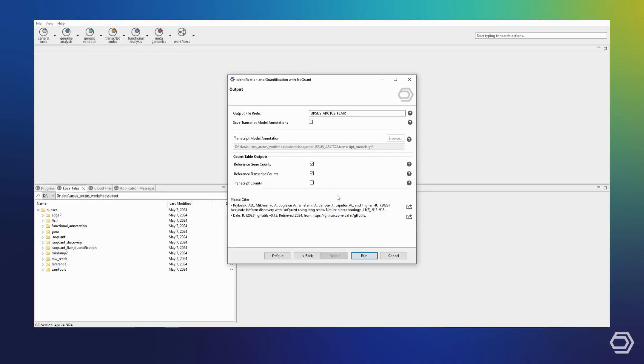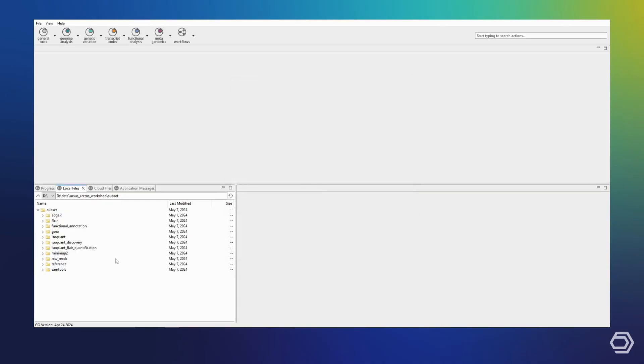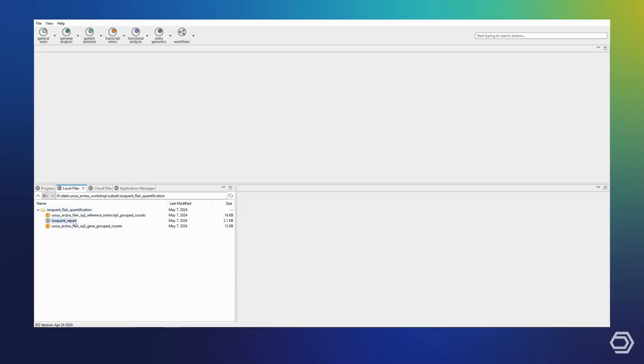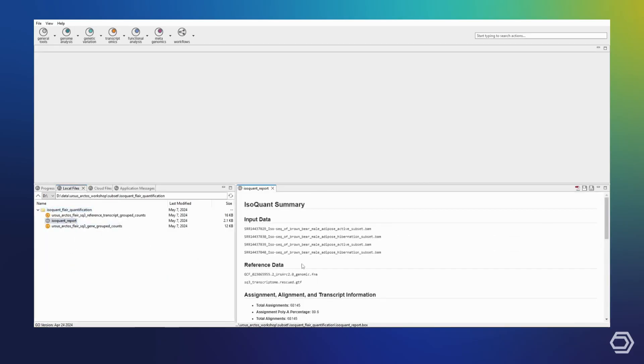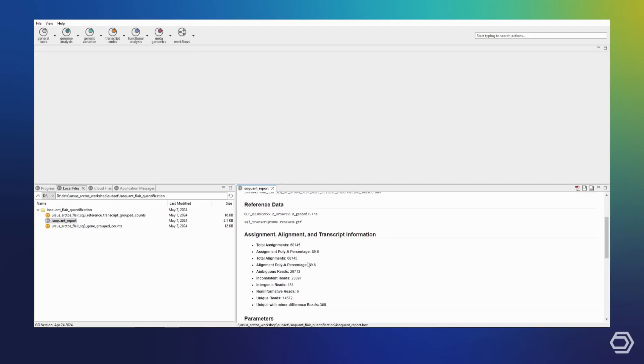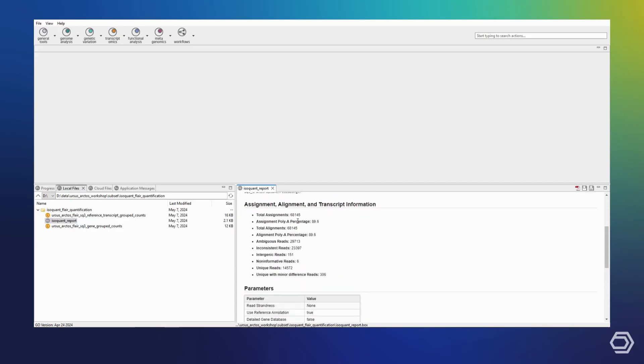Once again, we are ready to start IsoQuant, and I can skip ahead to my results. You can see that we have once again obtained a report with our input options as well as some basic statistics, and we have obtained our quantification tables now based on the provided transcriptome.